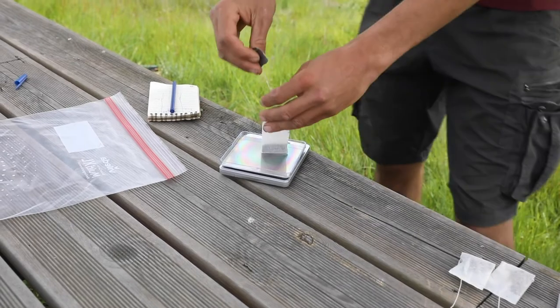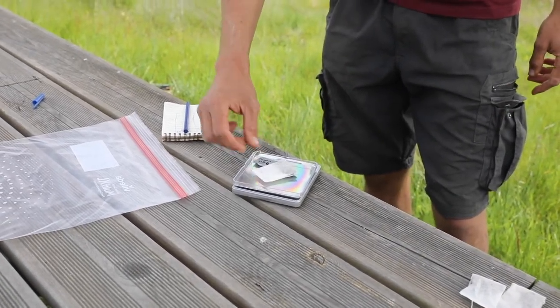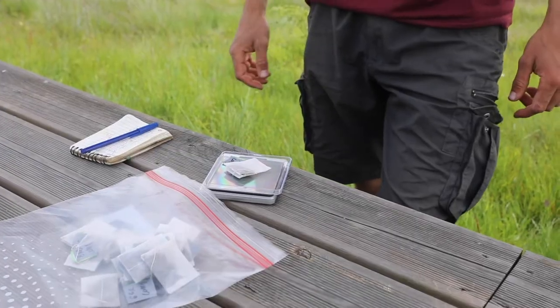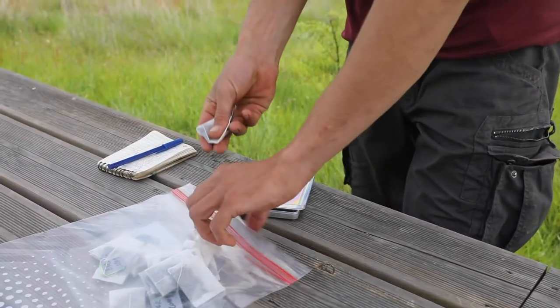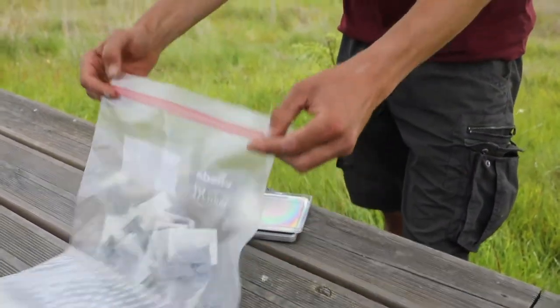Weigh the tea bags before burial and record the weight. Place tea bags in a ziplock bag or box until burial, then note the starting date of incubation.